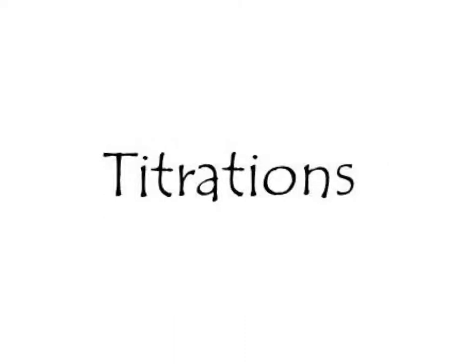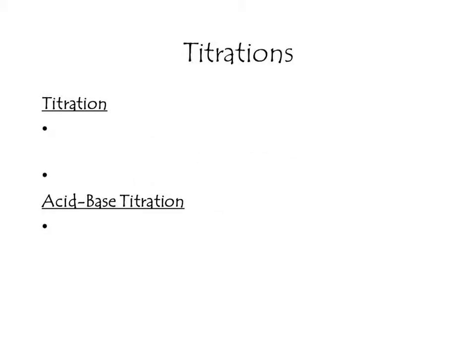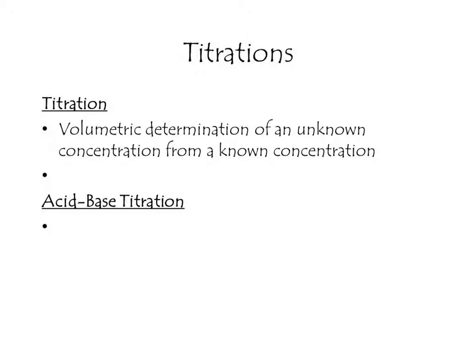In this video, we're going to go over titrations. Now, what's the purpose of a titration? Titrations really are used in a science lab in order for us to determine the concentration of an unknown acid or base from a known concentration of acid or base.